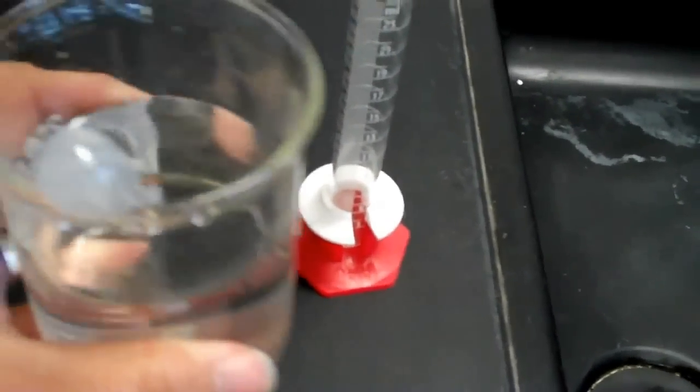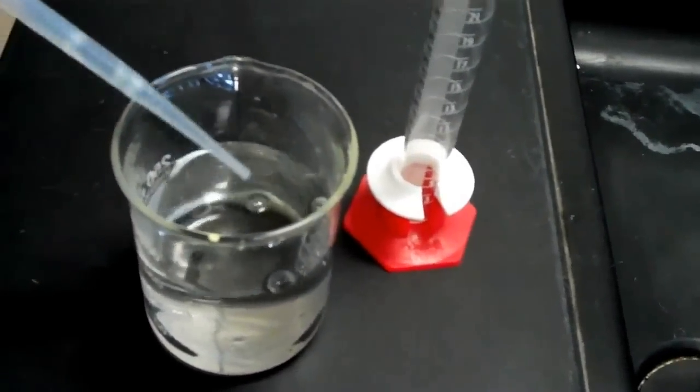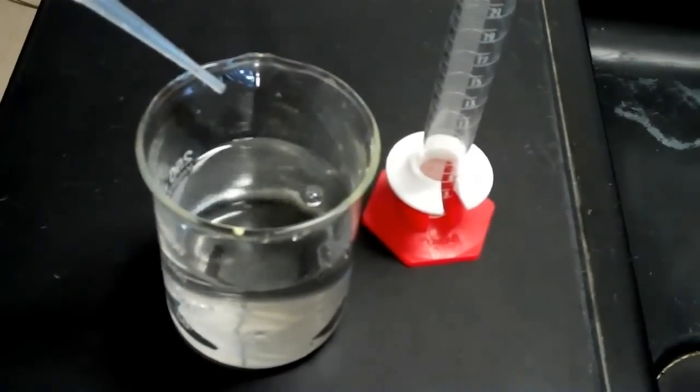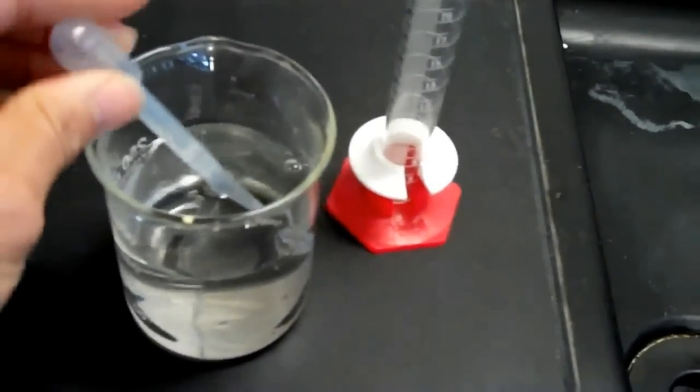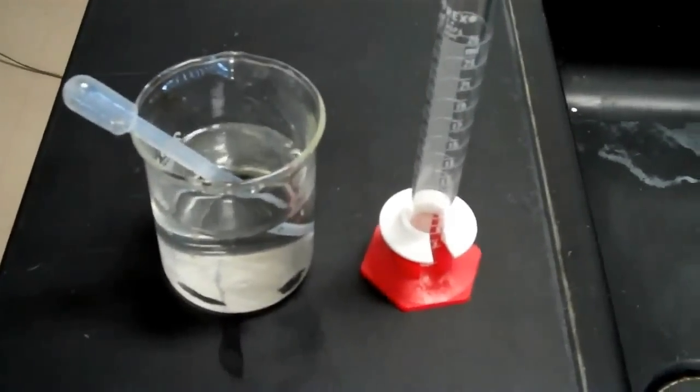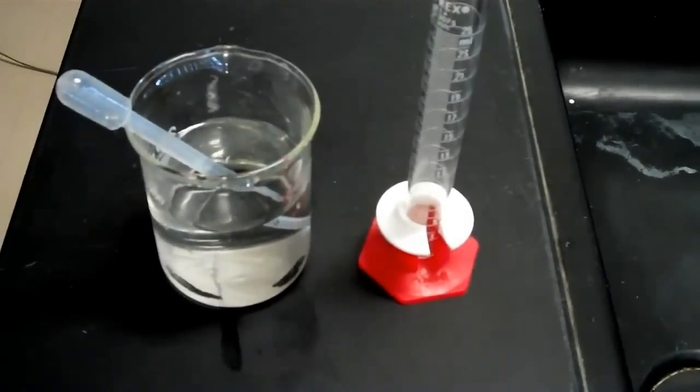Next thing I need is a beaker and a pipette. I'm going to be counting how many drops it takes to make one milliliter. But because drops are not exact amounts, I'm going to do this three times and then find an average.